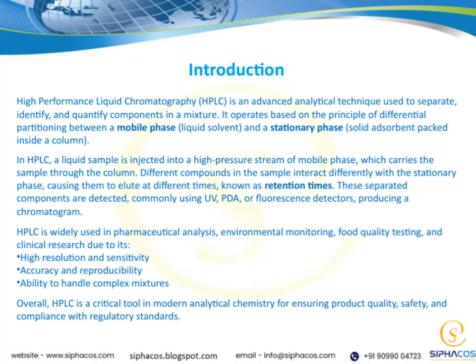Let's begin by exploring what high-performance liquid chromatography, or HPLC, actually is. It's an advanced analytical technique that allows us to separate, identify, and quantify the components within a mixture. The core idea behind HPLC is based on the principle of differential partitioning. Essentially, this means that different compounds in a sample interact differently with two phases: the mobile phase, which is a liquid solvent, and the stationary phase, which is a solid adsorbent packed inside a column.